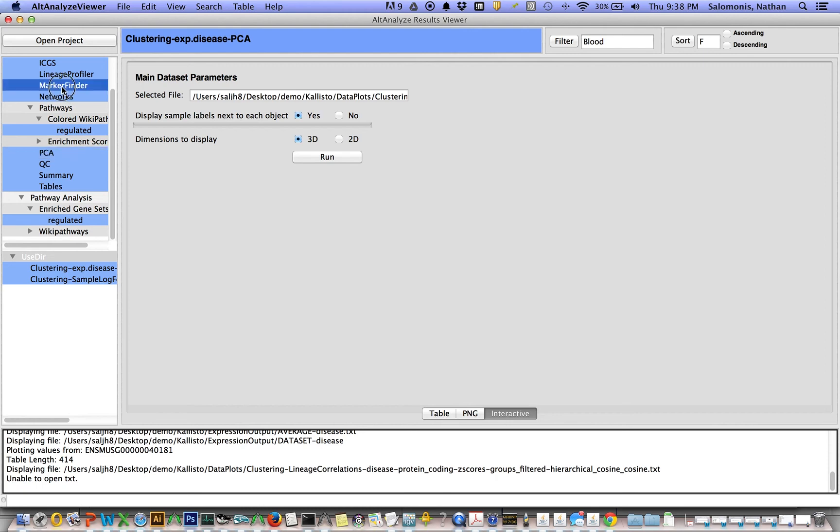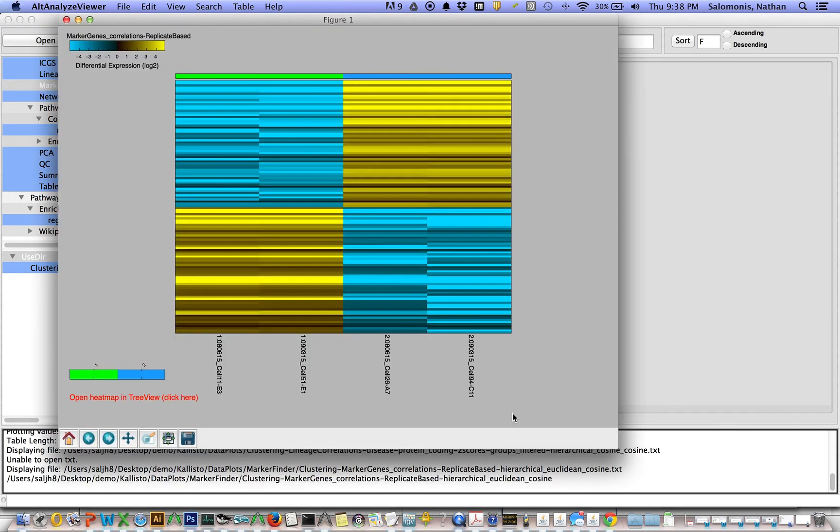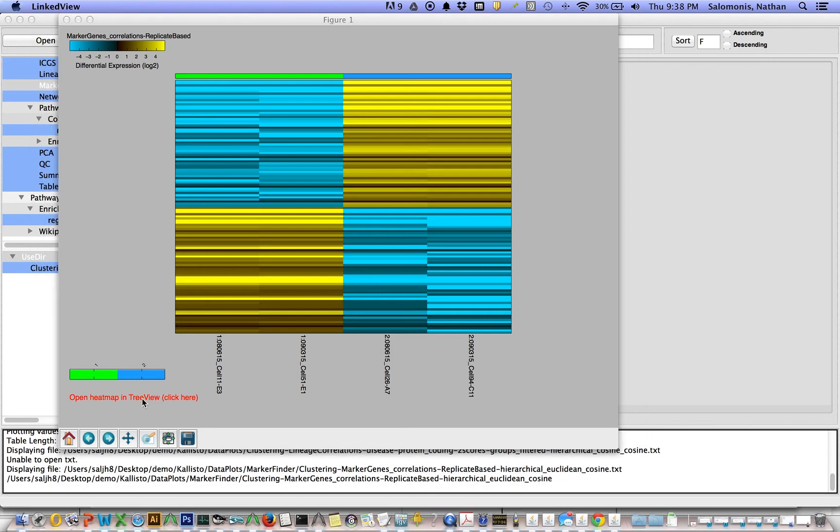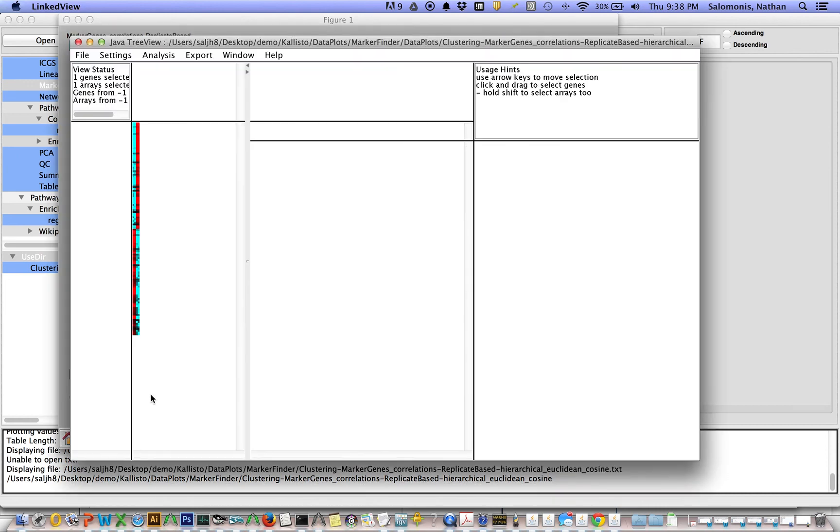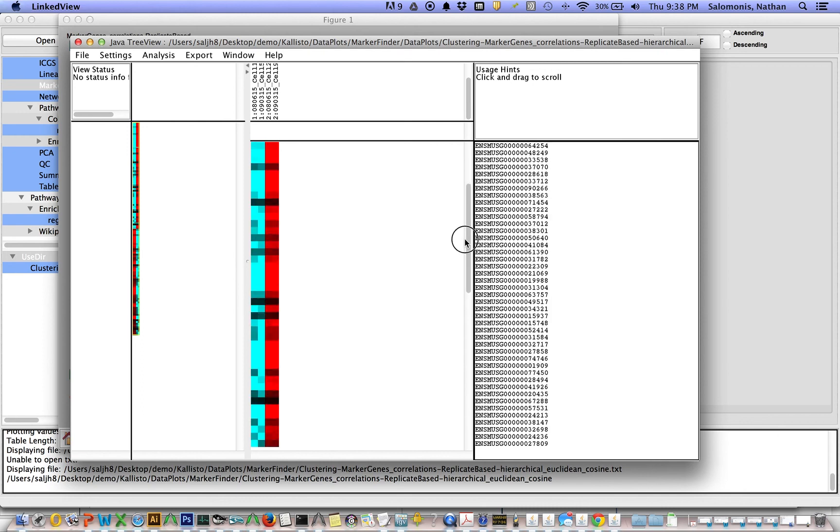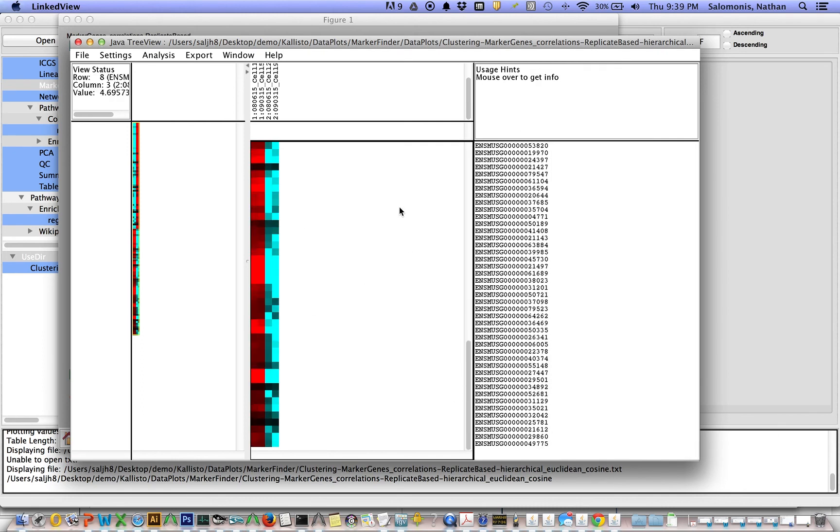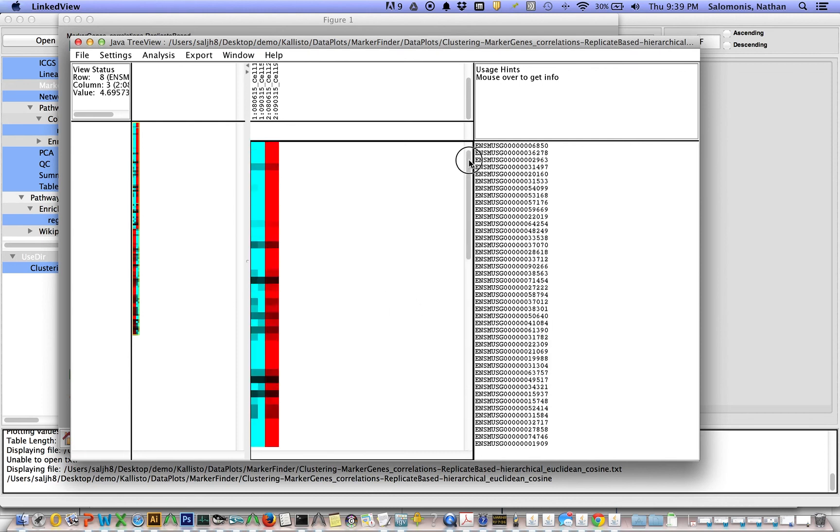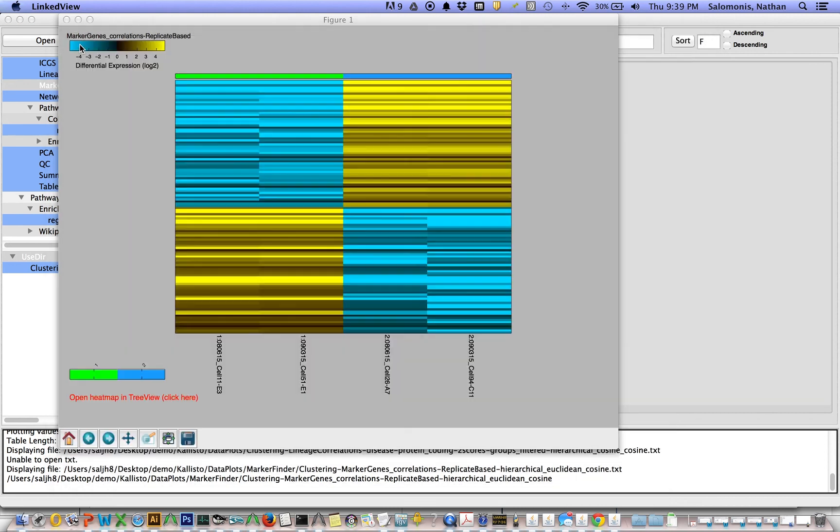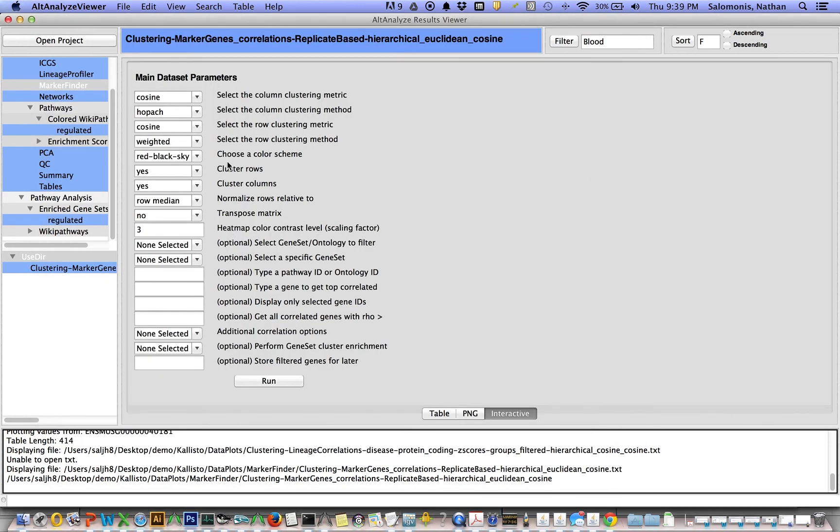You can view the marker finder results as an interactive heat map. If you click this open heat map in tree view option, this will open up the program tree view. And again, you can select individual genes and explore them. These happen to have Ensembl gene IDs. If this is not desirable, you can actually convert these in other tools within AltAnalyze to gene symbols.